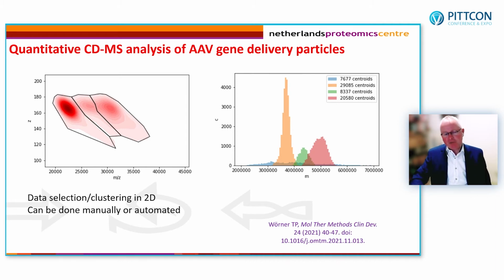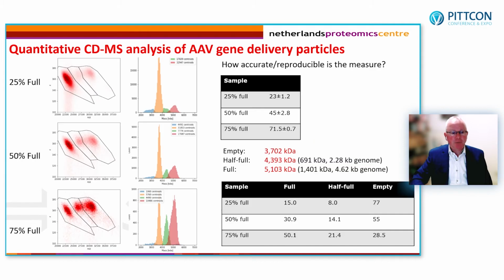Now, I also like to state this is single molecule mass spectrometry. So sometimes people ask me, how sensitive is this? Now, it's extremely sensitive because you need only a few molecules to measure it. So compared to what we are used to, our traditional native mass spectrometry, we often dilute our sample 100 to 1,000 times to get this data.